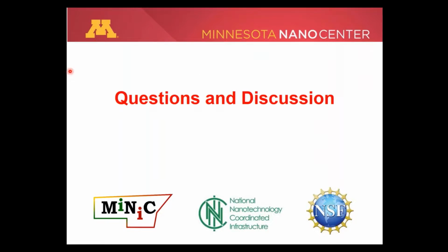With that, I'll get to the first question, and it's a question that a lot of us asked when we first got into using DLS, and of course it involves getting to the volume distribution. Is there any way to measure particle size distribution for particle mixtures of different refractive indices using dynamic light scattering? To my knowledge, you're restricted to the intensity distribution, which, if you can prepare your sample so that large particles are not there, then perhaps that would work well.